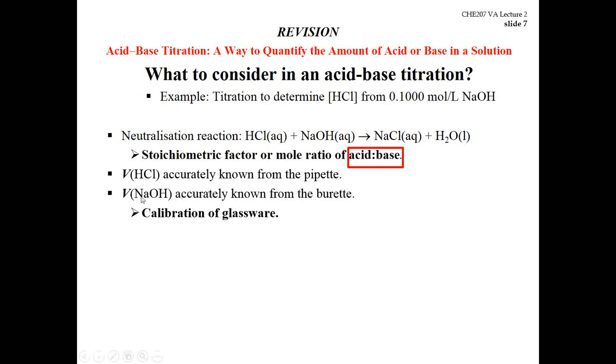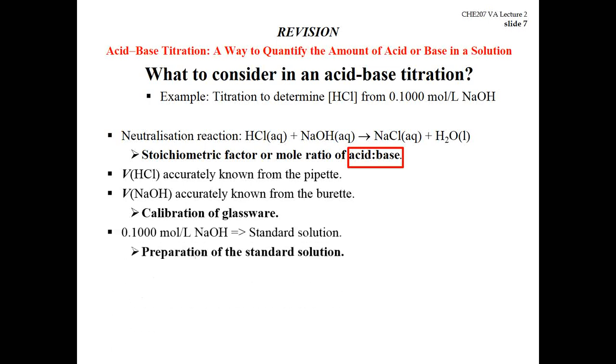We also need to know the volume of NaOH delivered from the burette accurately. In order to have accurate volumes, we need to know how to calibrate glassware. We have to use the concentration of the standard to determine the concentration of the analyte. So we need to know what we can use as a standard solution and how to prepare the standard solution.